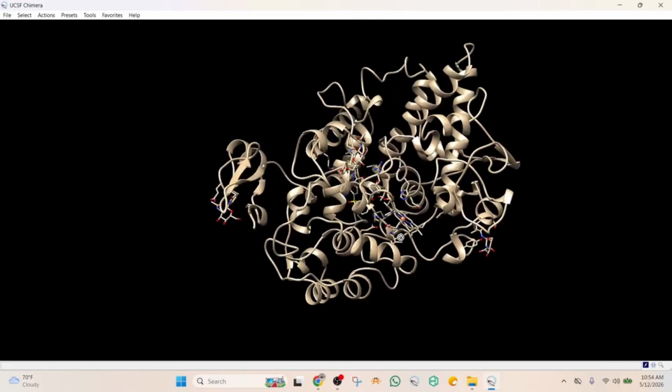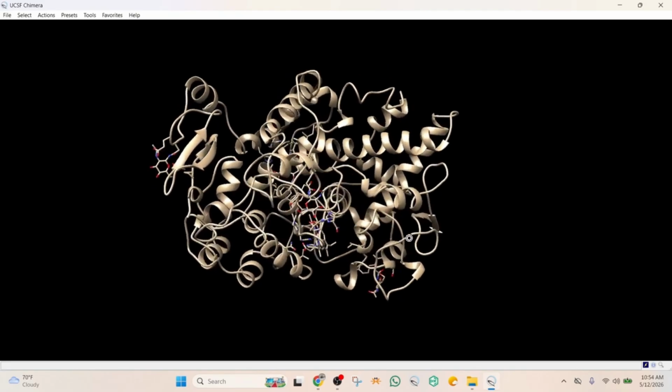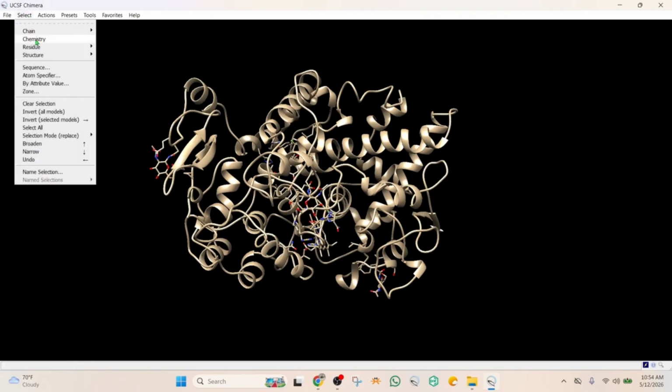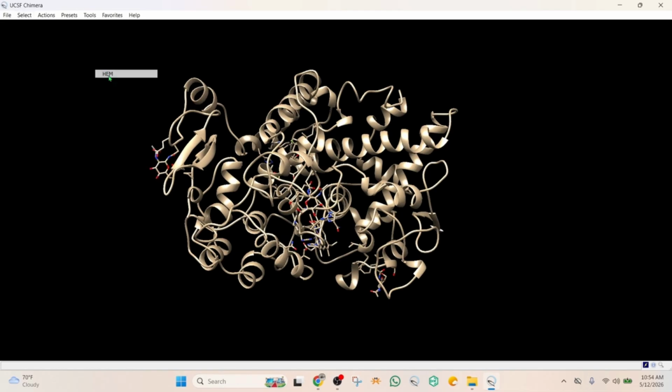I've told you about the parent ligands present in this COX receptor. There are three parent ligands: NAZ, HEM, and S58. In the experimental data we have already found that S58 acts as an inhibitor of cyclooxygenase. So let's focus on that inhibitor, and let's screen aspirin in place of that S58. So let me delete the other residues, for example, heme.